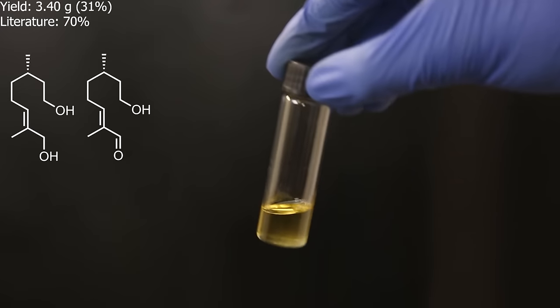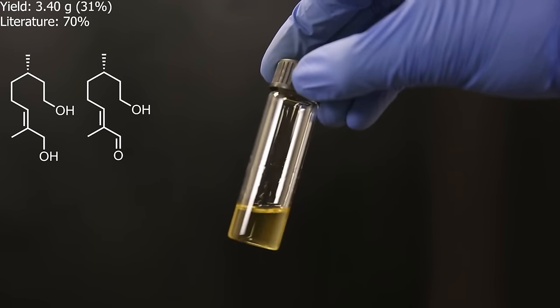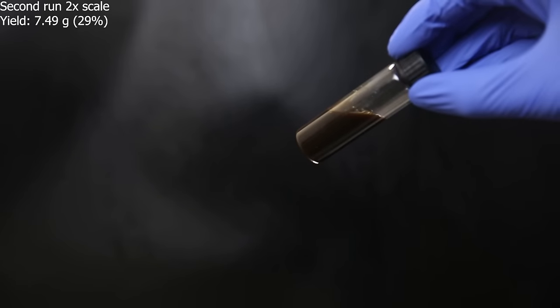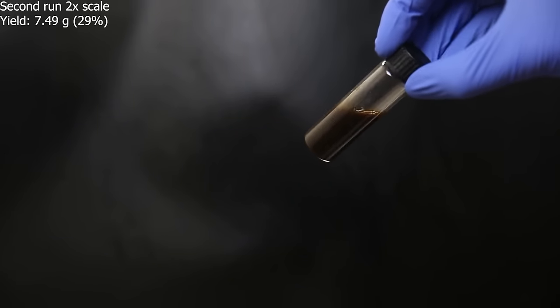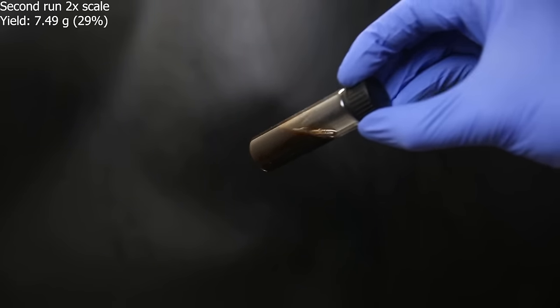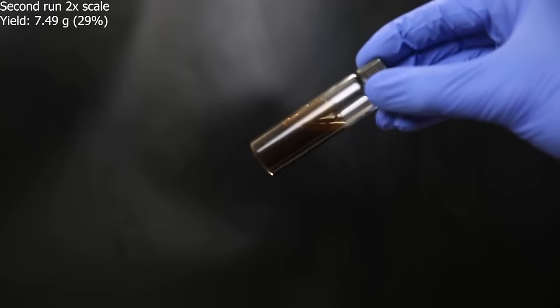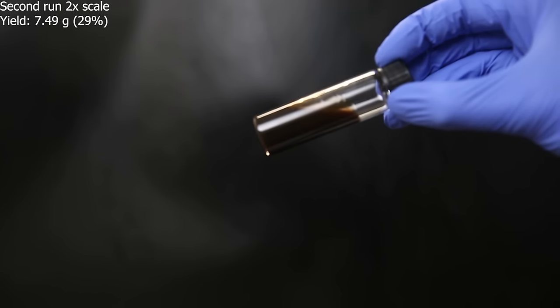This is a lot lower than the literature, but I'm not really sure why. I also did the reaction a second time, and the yield was pretty much the same. But I managed to spill some sulfuric acid in one of my fractions while cleaning, and it turned brown after I concentrated it down. So I'm not sure how much I destroyed, because it still smells pretty nice. And so I used it anyway.